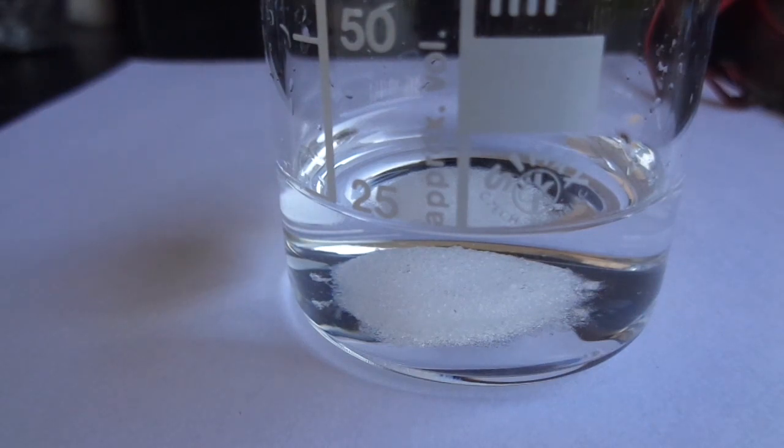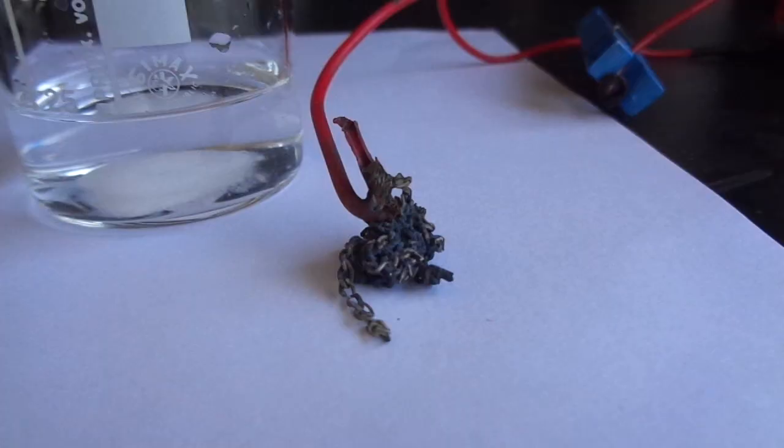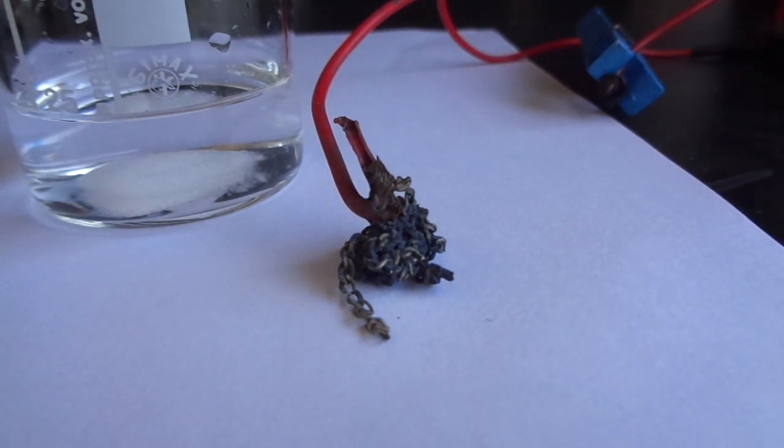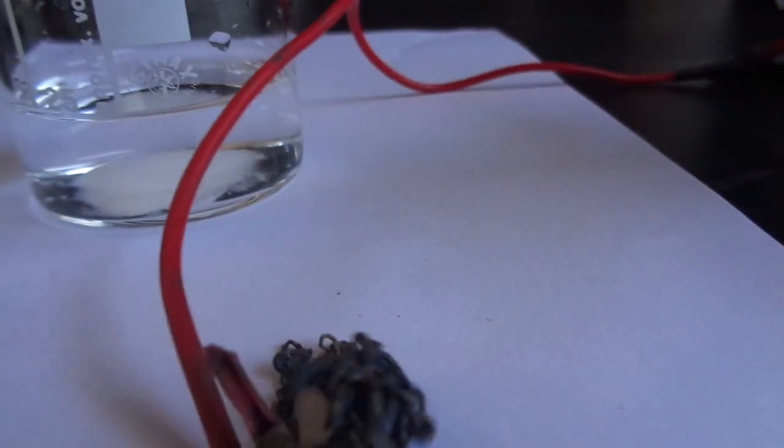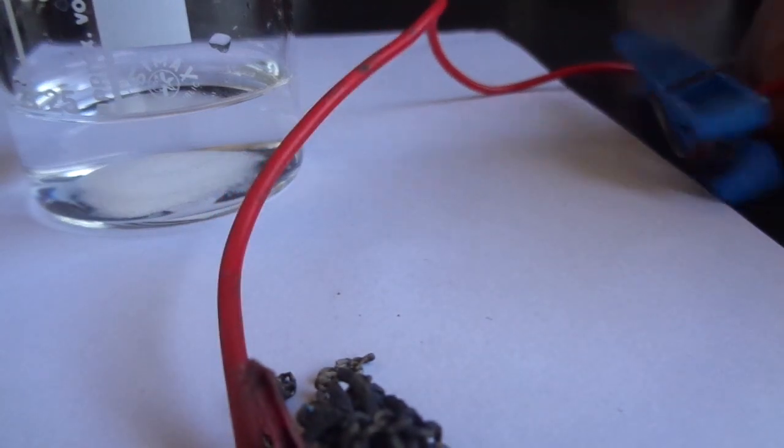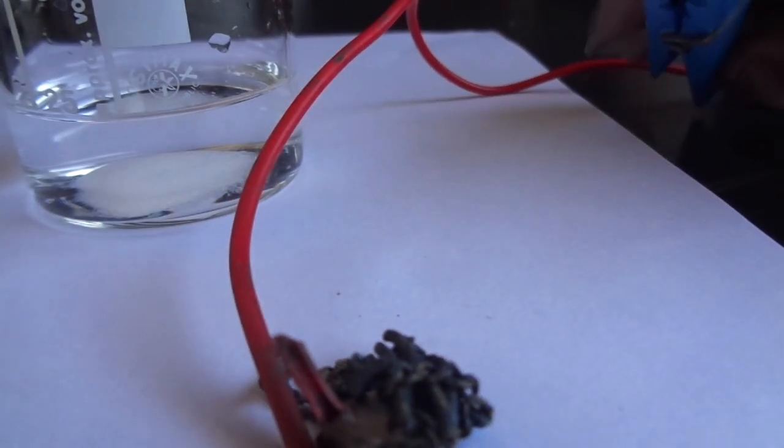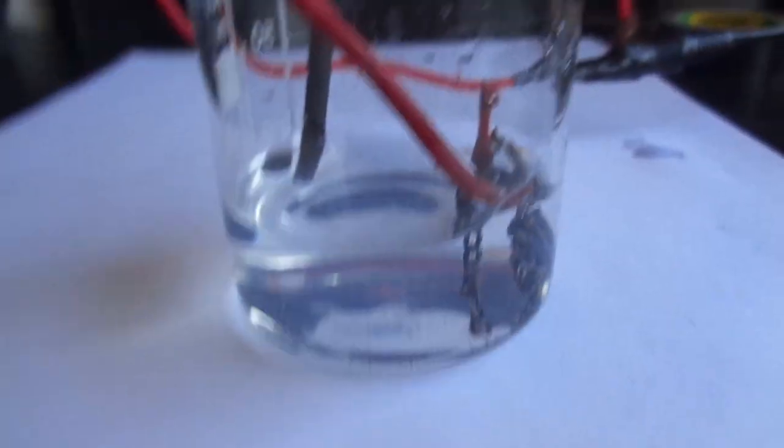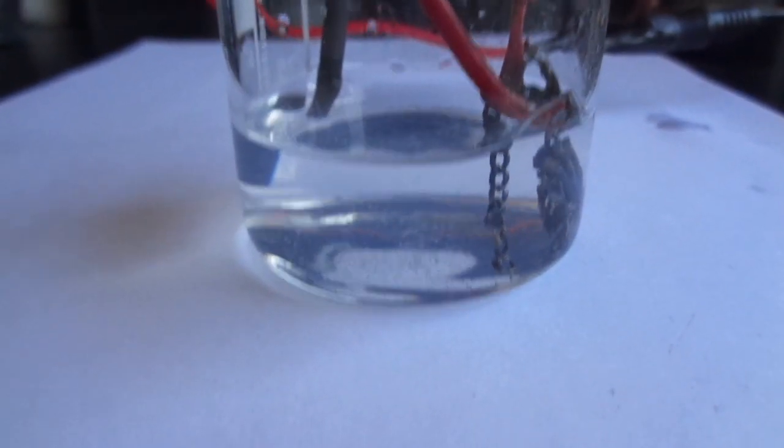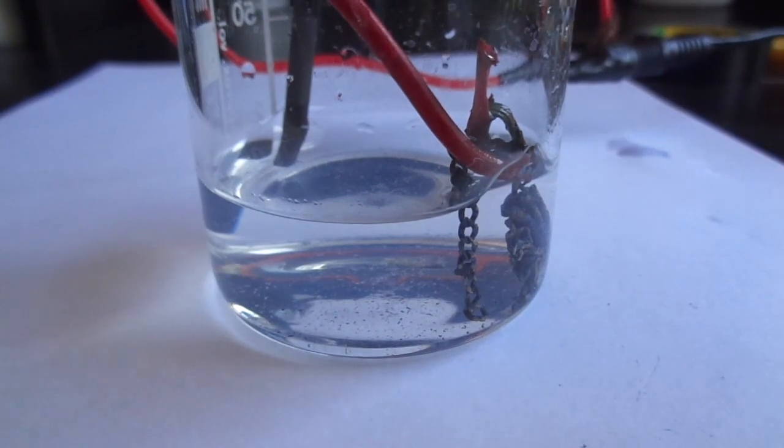The scrap silver has to be at the anode, so it has to be hooked up to the positive terminal. The carbon or copper electrode has to be cathode and it has to be hooked up to the negative terminal. Let me get this all set up and now let's turn on the power supply.